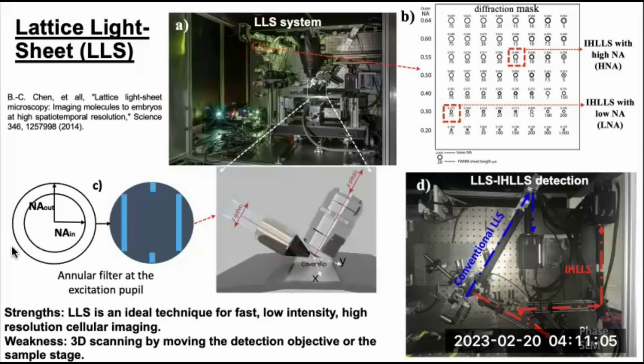A particular pattern is created in the back focal plane of the excitation objective that results in a lattice, an array of non-diffractive beams parallel to each other in the sample plane. Galvo mirrors dither the sheet in X and sweep in Z. The Z galvo synchronizes with the Z piezo, which moves the objective, to scan an object in 3D.